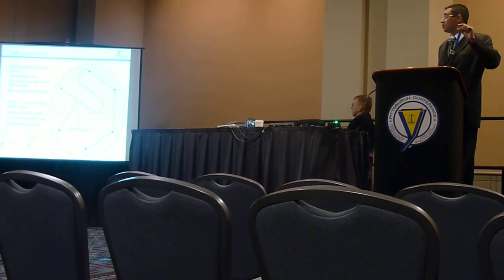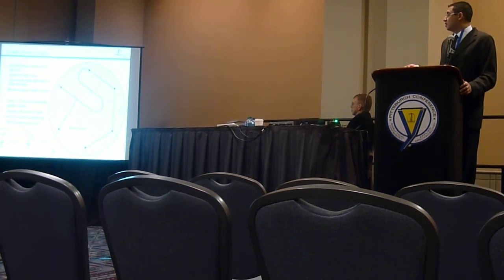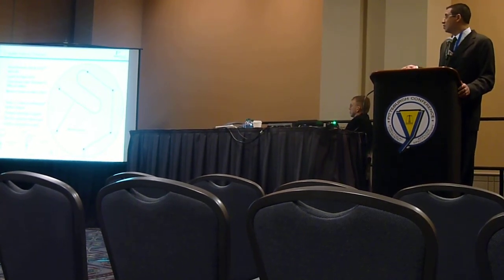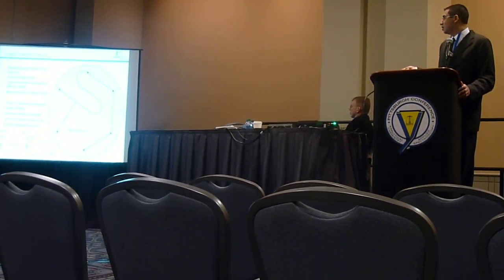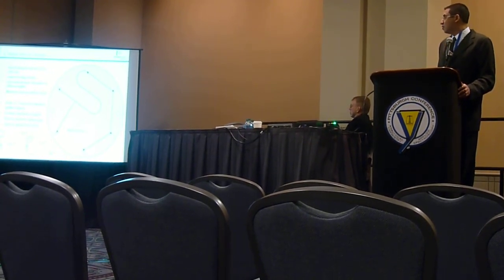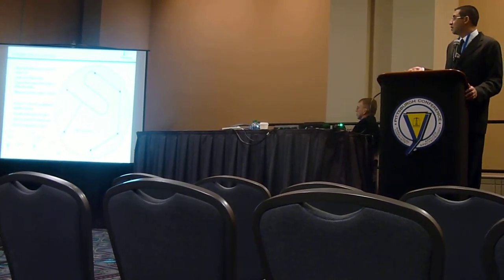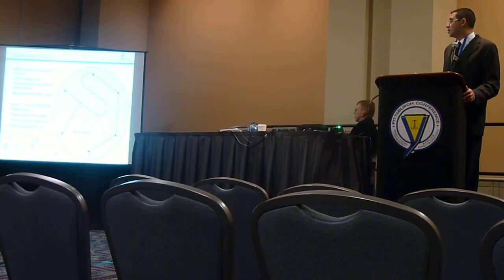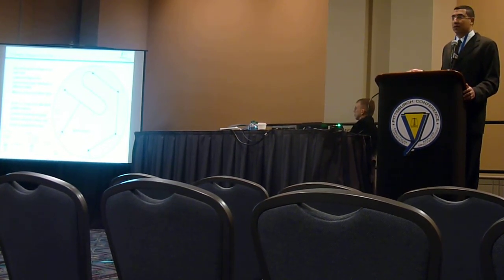It's basically a wafer. Each layer is about 80 micron thickness. They are laser etched into the metal that made that material, and those channels are 50 micron in size. As you see, at port 5 in my experiment, this is my pressure source. At port 6, I connect the pre-column, where all the sample will be injected and separated. And then you can split up to 4 different outlets at the other side.